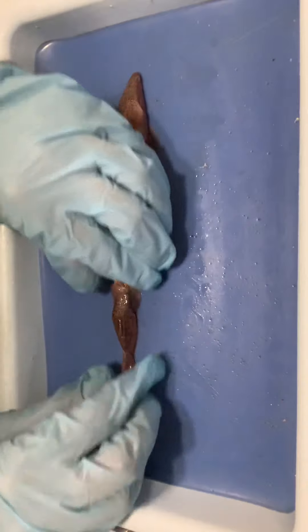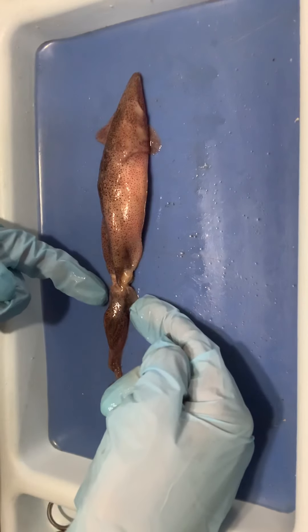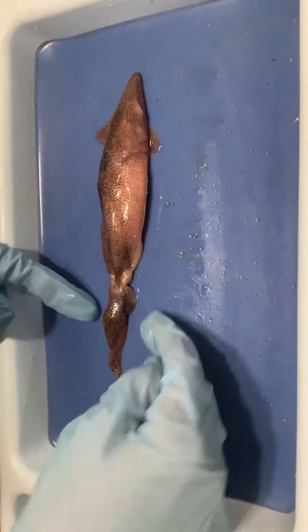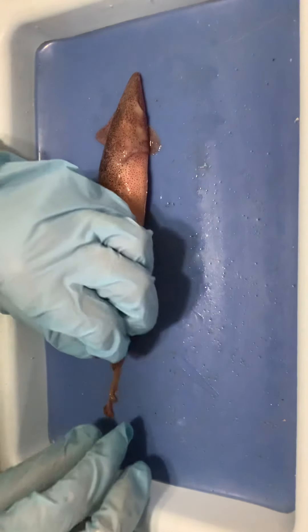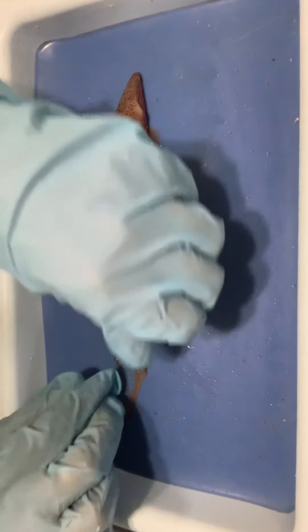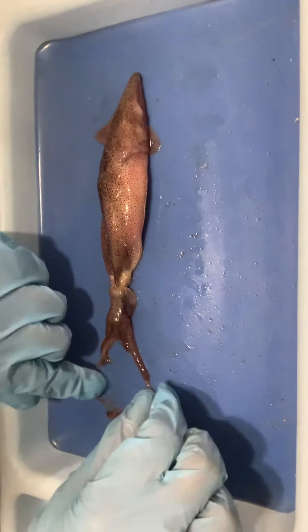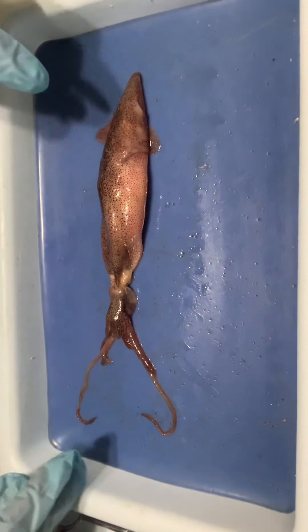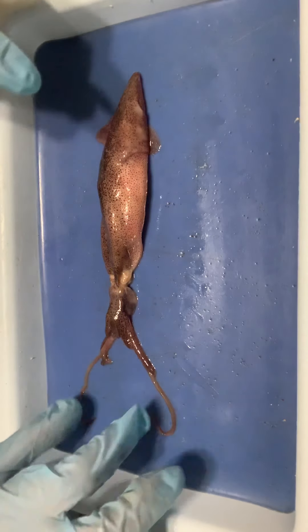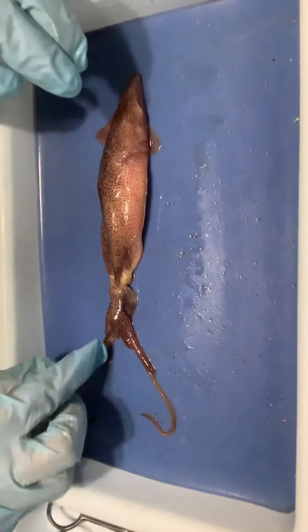Going down to the head-foot region, away from the visceral mass, we have the eyes on the side — they have very well-developed eyes. We also have the arms and tentacles. The arms are the shorter appendages, and the two longer ones are the tentacles. The tentacles are used for grabbing prey and pulling them inward, and the arms help with maintaining the prey in that area.